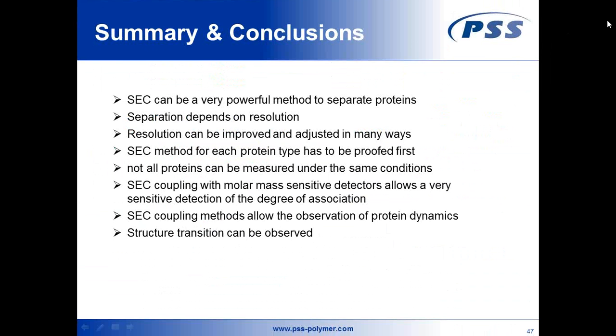The radius of gyration should be above 10 nanometer. Okay, so that's good. And then the follow-up question to that, since you also introduced the viscosity detector, is there an advantage or disadvantage of using one over the other to get the data?